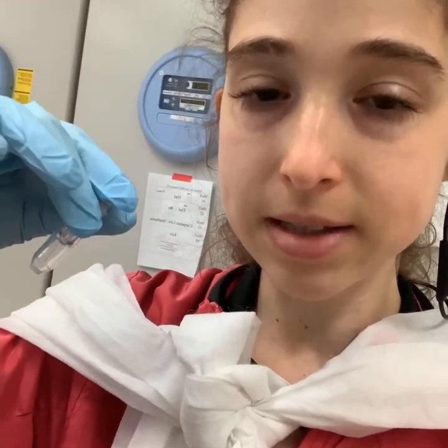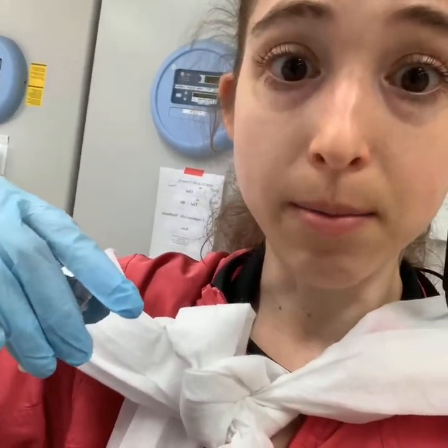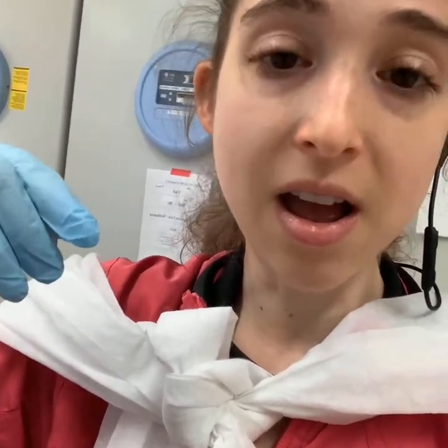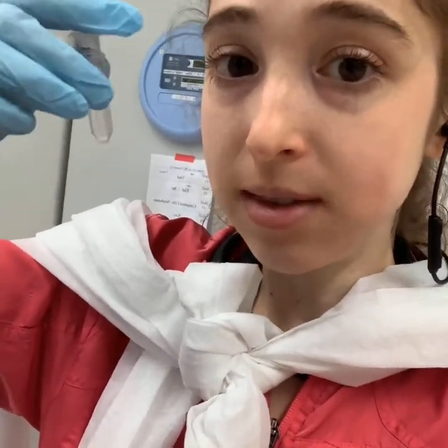Those are basically some things about these centrifugal filtration devices — and one of these days I'm going to learn how to pronounce that better. Until then I just call them spin concentrators. But there's more than you can do than just concentrate with them, so let's talk more about what those uses are.